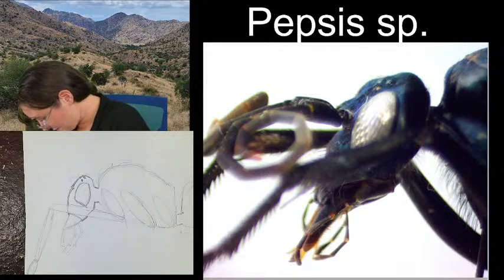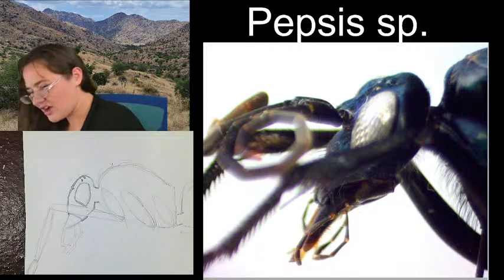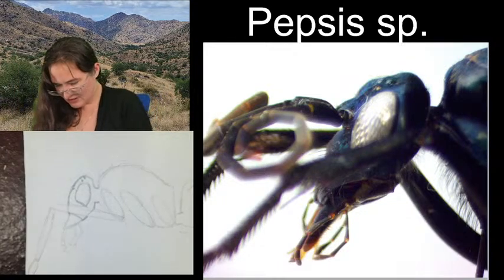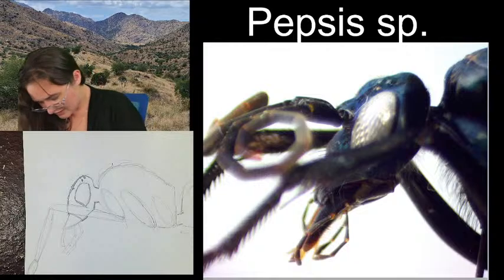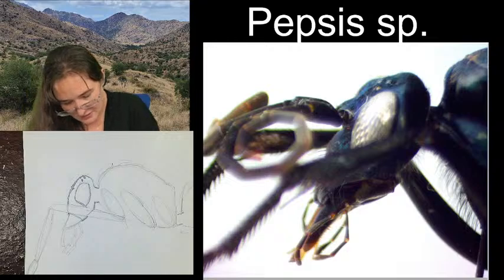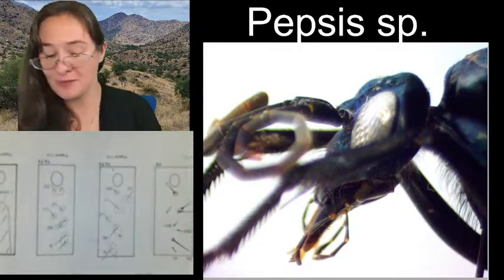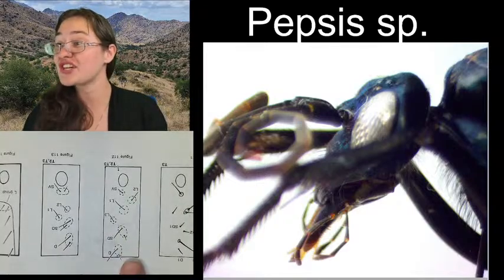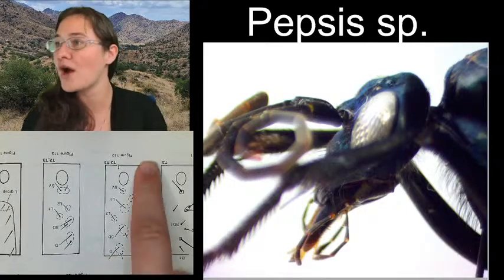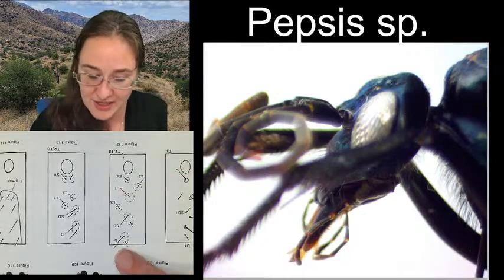Okay, here we go. Do they call them stomata instead? All right. So, here's some fun things that I can show you. This is a caterpillar book. These are our caterpillar charts. So these are essentially one segment on the edge of the abdomen, and it has each individual hair, where it is, and what the name of it is.